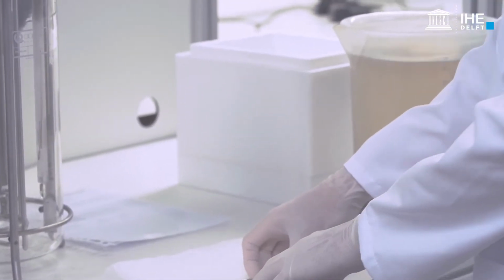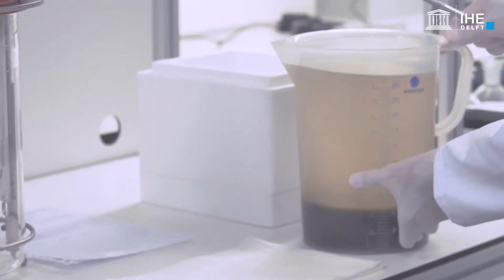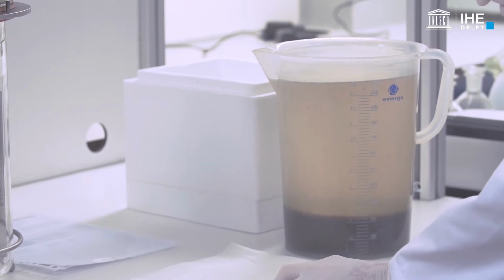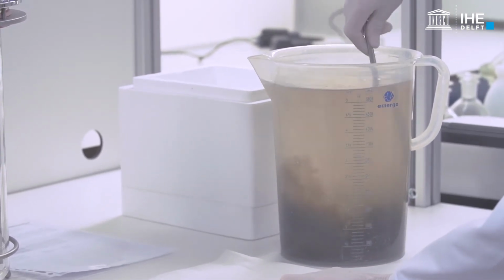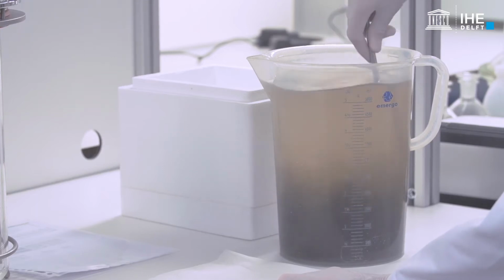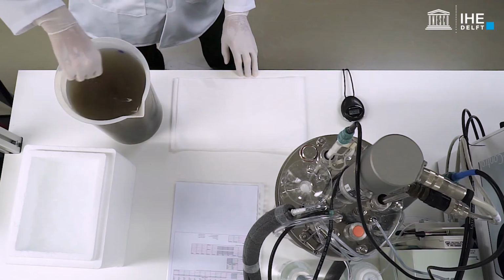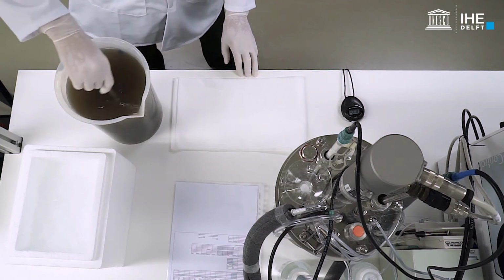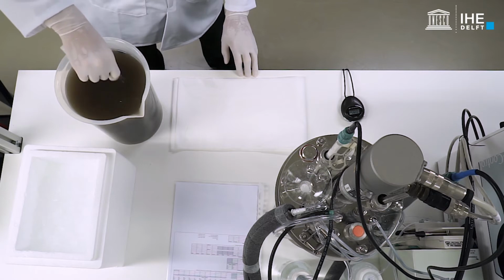After the sludge has been collected and washed, if applicable, it should be carefully poured into reactor 1. Before pouring the mixed liquor into the reactor, mix carefully the sludge to get a homogeneous sample. This will avoid that the biomass settles and remains at the bottom of the bucket.